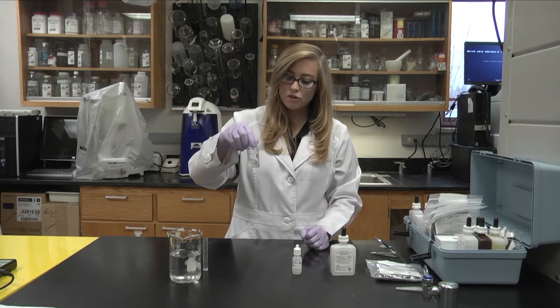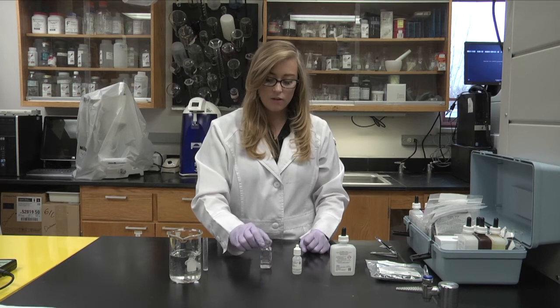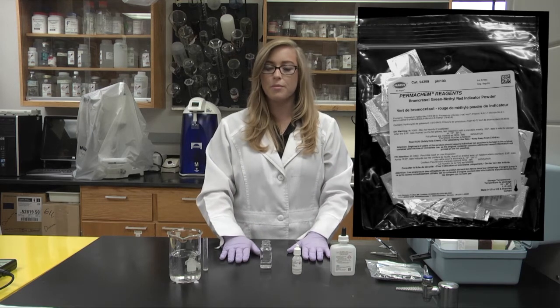If the water turns pink, then you're going to want to titrate with the sulfuric acid. However, in all cases it does not turn pink, so then you want to add a packet of the Bromisol Green Methyl Red Powder Pillow.